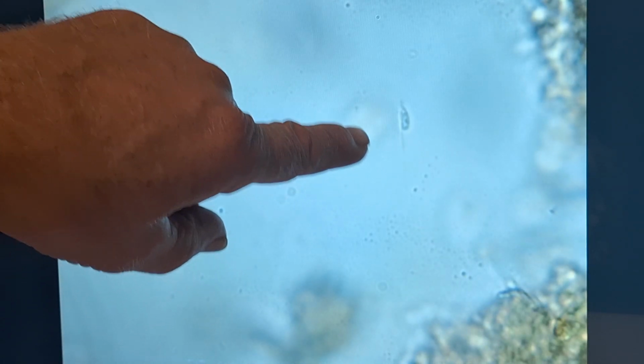There's a very active flagellate right there. See on this outer layer, again, the flagellum behind it. They don't often move straight like that. There he goes whipping around. More known for that erratic movement like that.